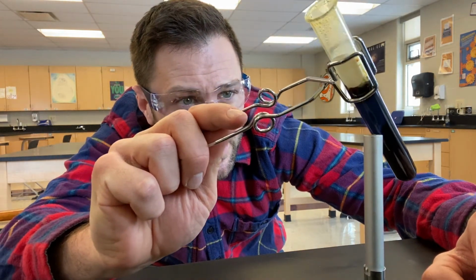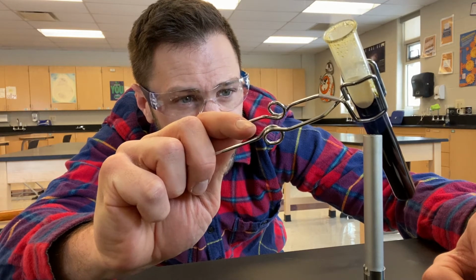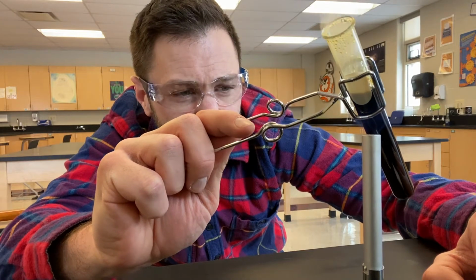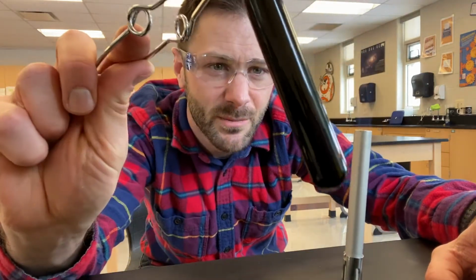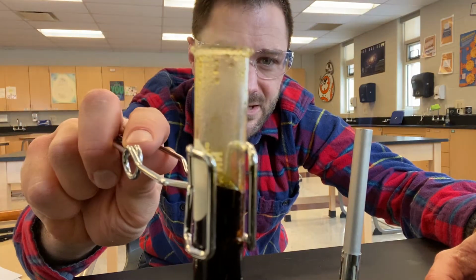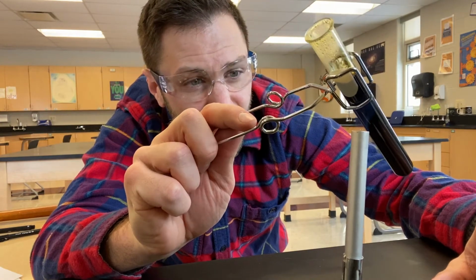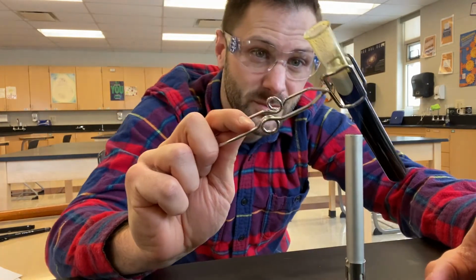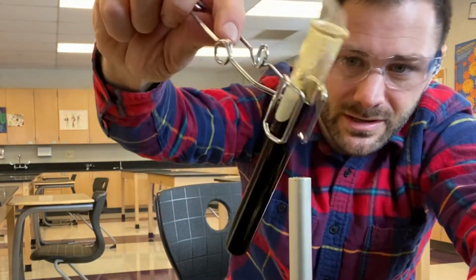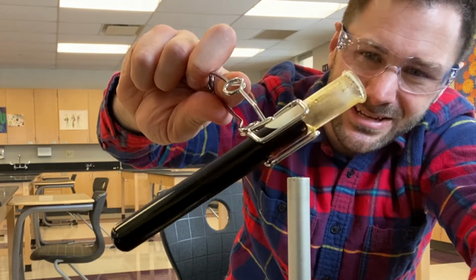I'm going to keep going, keep burning. I still see some bubbles in there, which shows I have that liquid. Anything that I burn tends to expand and turn darker, so I want to keep going. Remember how when I had the sugar in here, it only took up maybe that much of the test tube? Now look at how much of the test tube is full of something. I'm guessing you're making obvious connections here, but there's a lot about this that doesn't look like sugar anymore. The question is, what is it if it's not sugar?